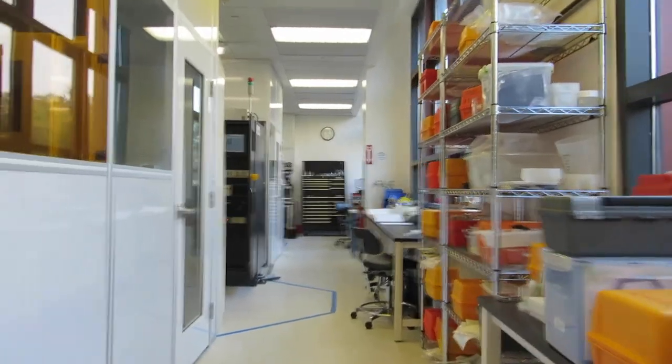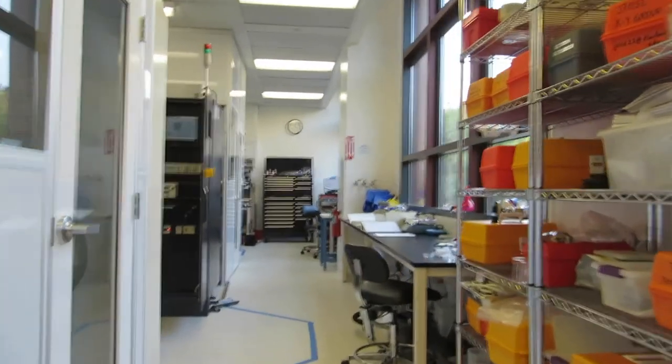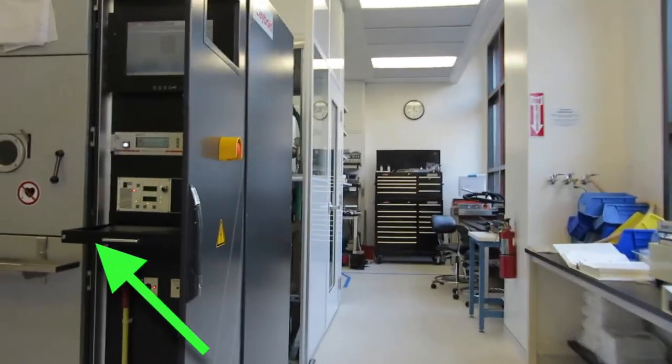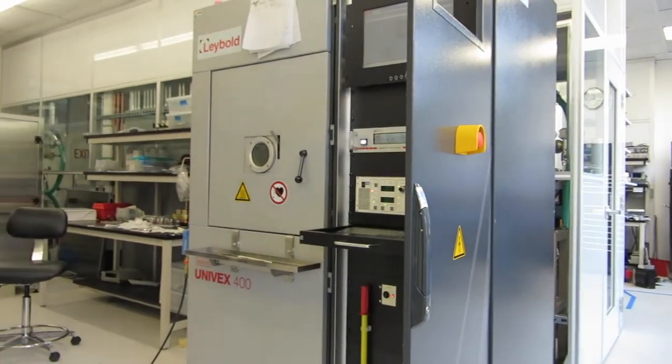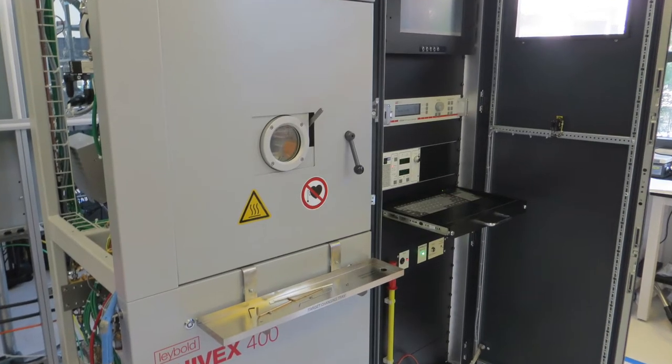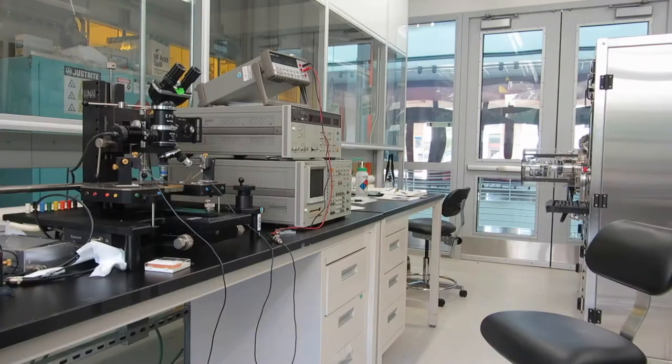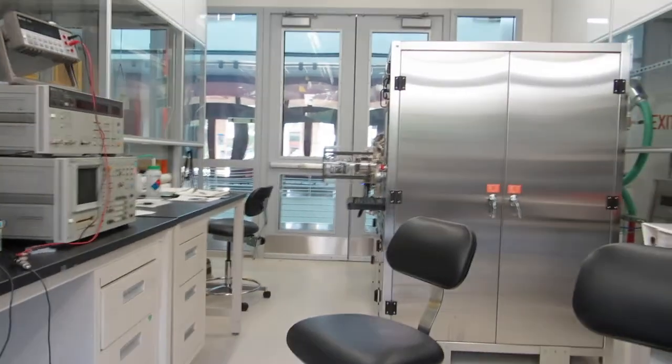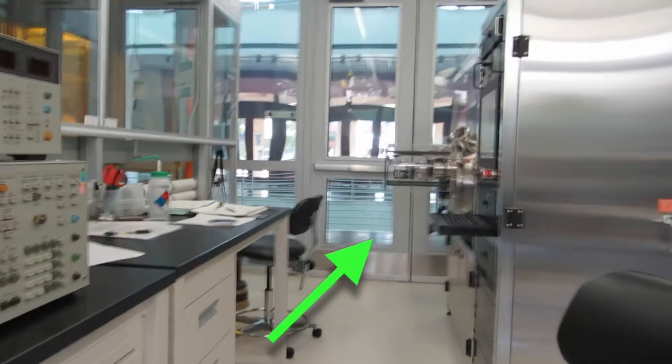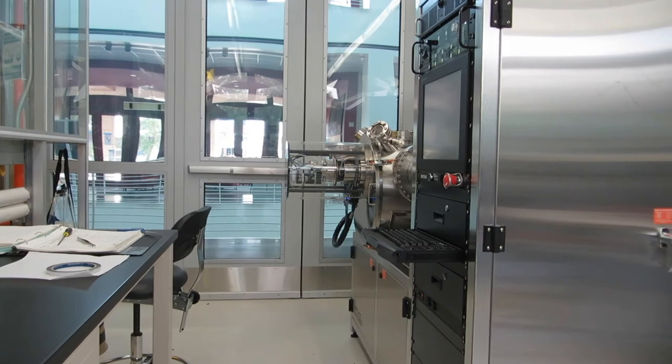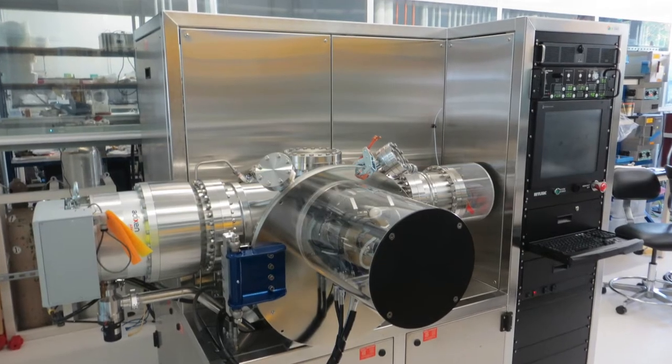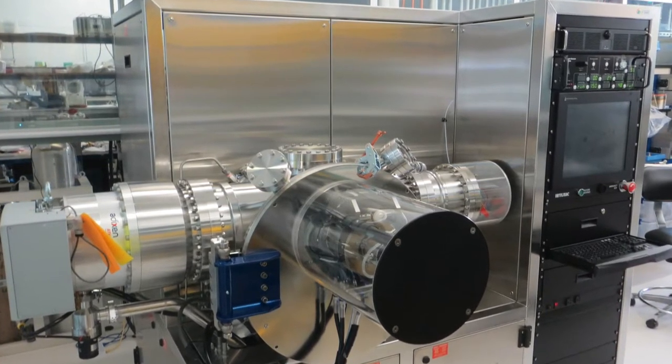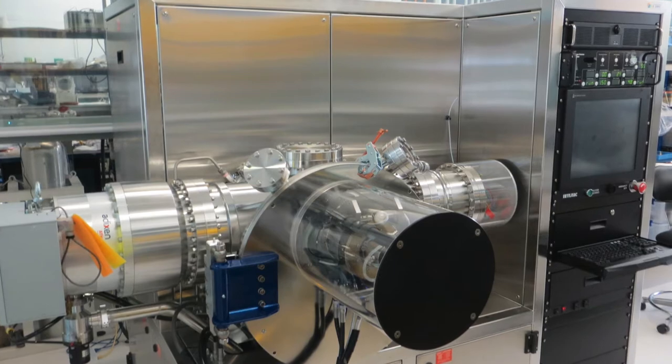The next room down is where the sputter station and ion mill are located. The labeled Univex 400 sputter station has three three inch sputter guns. Two guns are for DC sputtering of metals and one gun for RF sputtering of dielectrics and metals. On the left is a probe station for general testing and then down at the end of this room is the ion mill. The ion mill uses a beam of argon ions to directionally etch away any material. The sample mounting stage rotates for uniformity and can be tilted to optimize the desired sidewall profile.